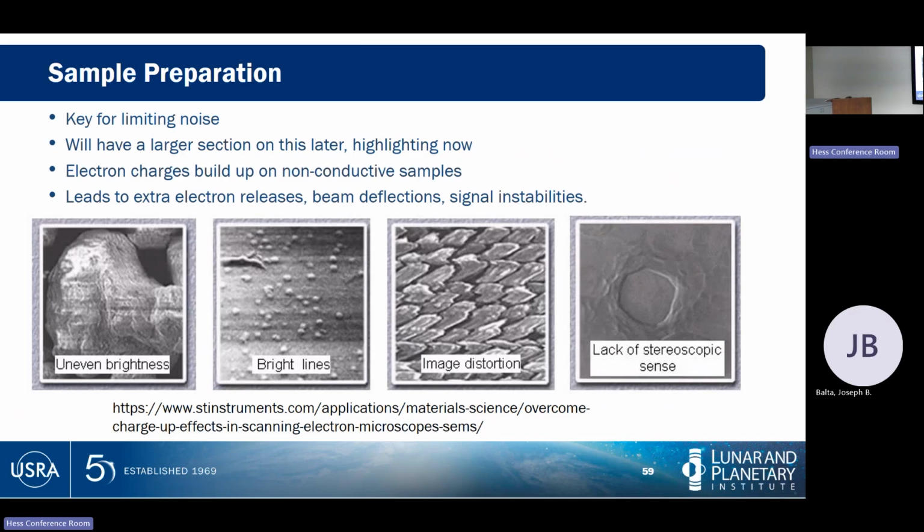And then the other thing to manage signal to noise is sample preparation. This afternoon, many of, or at least one of the 2 groups will spend time doing sample preparation with me. We're going to give a brief overview of it here, and then we'll let you play with that more later.